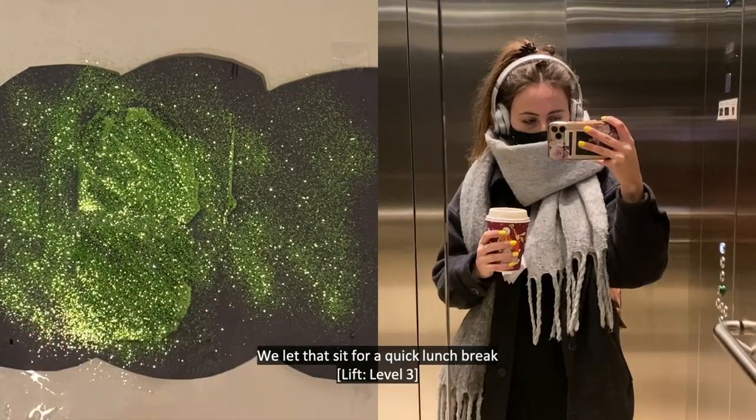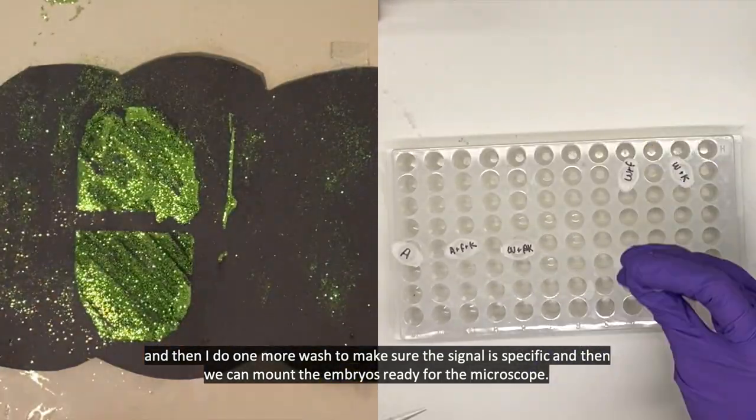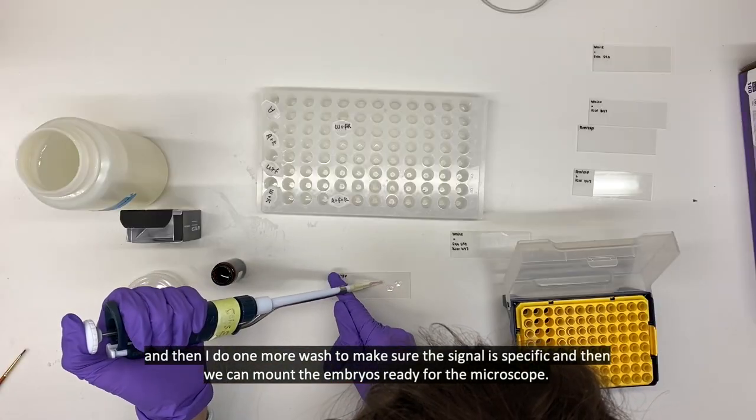We let that sit for a quick lunch break. And then I do one more wash to make sure the signal is specific, and then we can mount the embryos ready for the microscope.